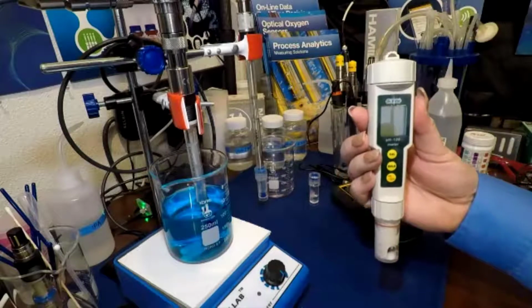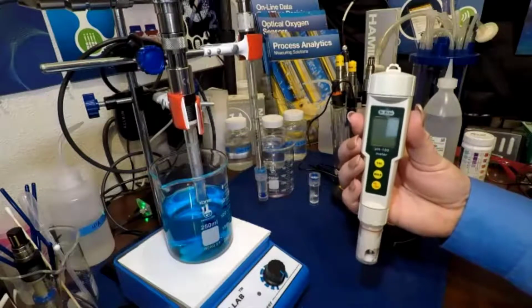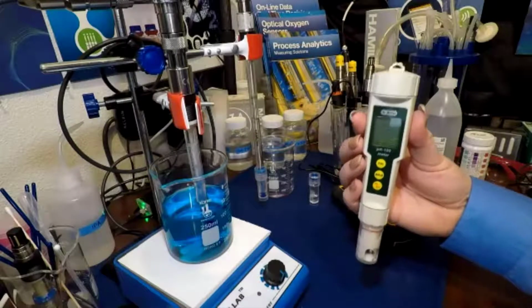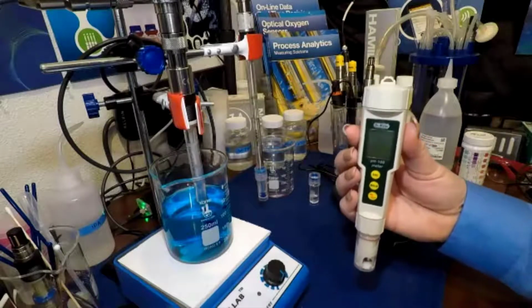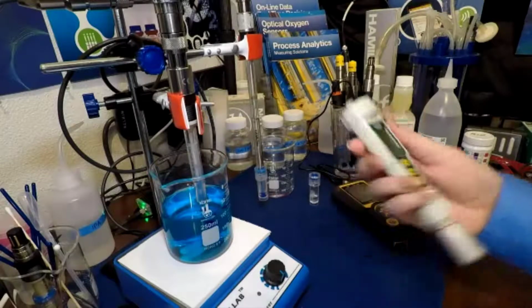These were meant for hot tubs, maybe for waste streams, rivers. They're great for that. But they are absolutely not meant for biological work. They don't have good accuracy. They cannot be sterilized or cleaned. They're just not meant for that.